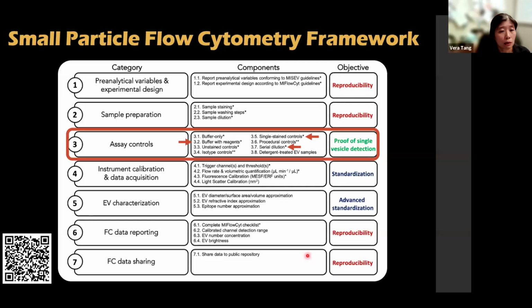benefit. People are always asking, how many different fluorophores, how many different markers can I put on an EV? What's the max number? And I guess the answer is always, it depends, right? Depends on the marker, depends on the expression level, etc. But your single color control is going to allow you to experimentally determine your max number. Because if your single color control staining intensity is the same as your multicolor staining intensity, then you know that there is no inhibition or competition of the different markers with each other. So this single color control actually serves double duty.